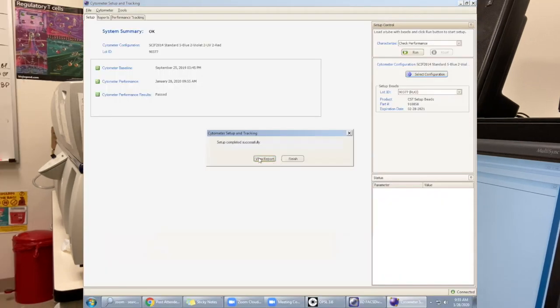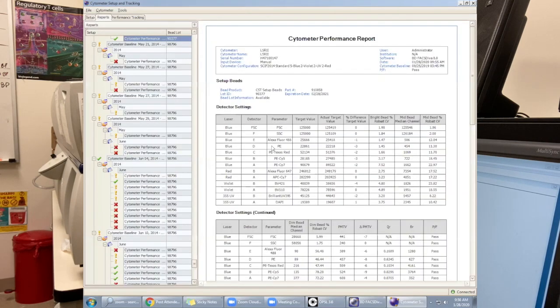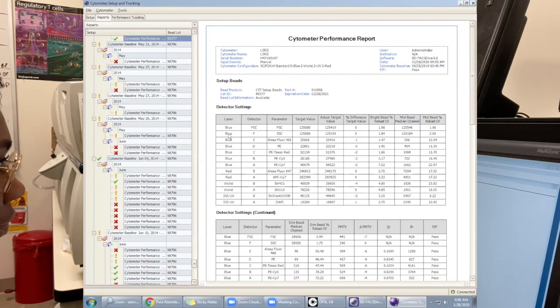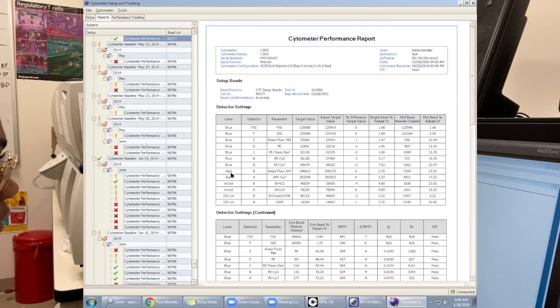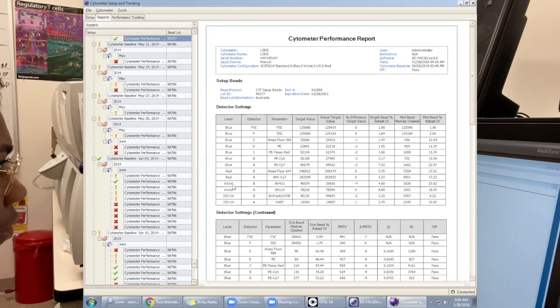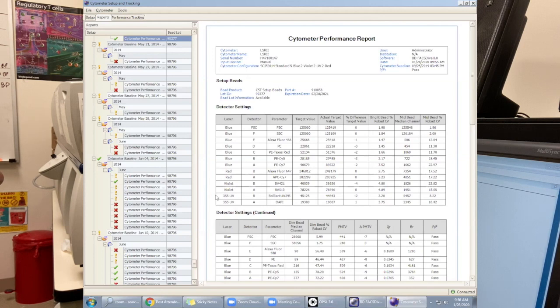You want to view the report. The two main things that we're looking at here are the bright bead robust CVs and the delta PM TV. What you want to make sure here is that the first of each laser is really low. You don't want to see high numbers or anything going up to six. The machine will tell you a warning.